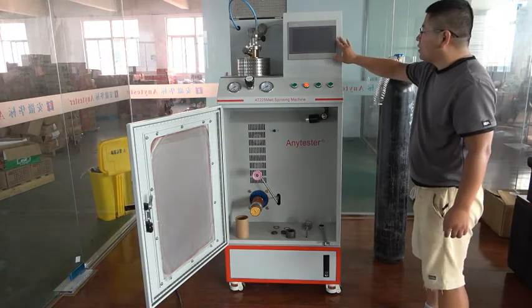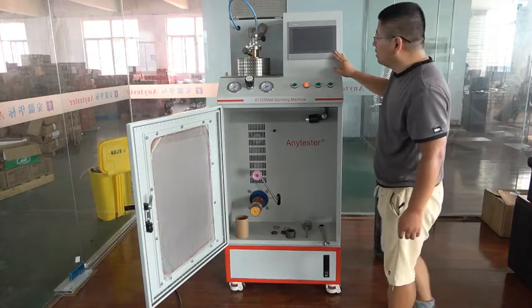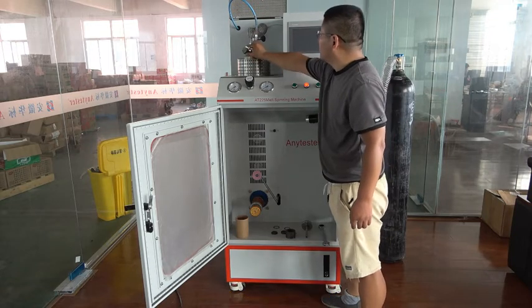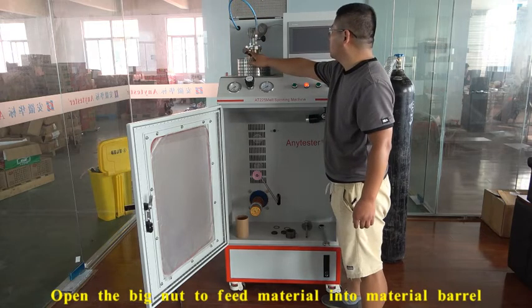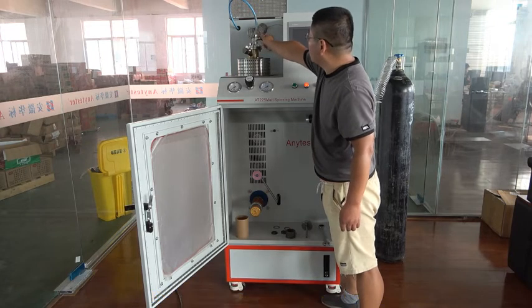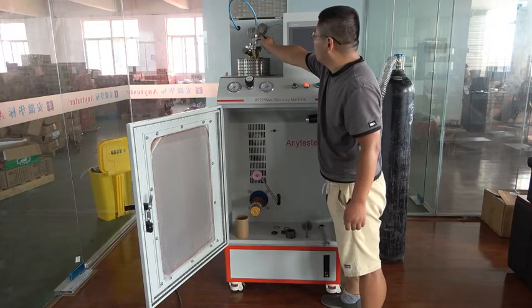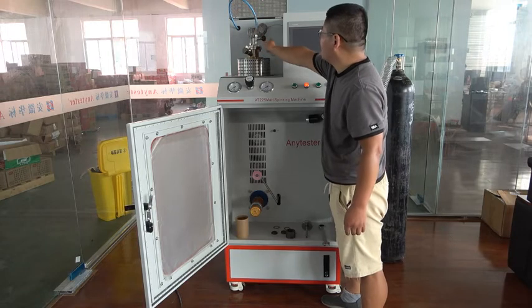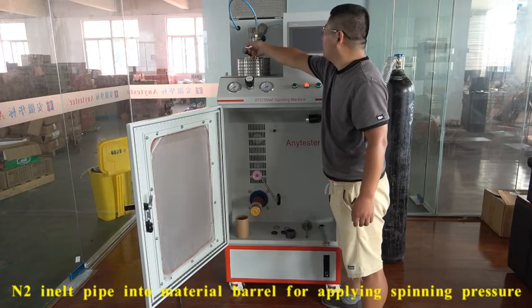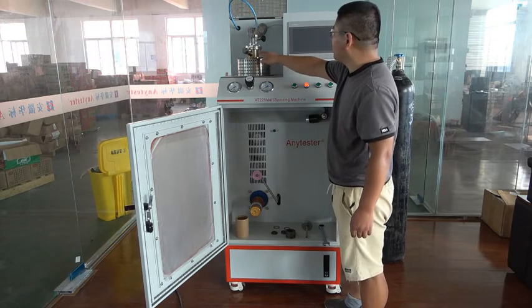This touch screen is for controlling and displaying the temperature. This material barrel — this nut can be opened to fit material into the barrel. This valve is for exhaust. After spinning, open the valve to exhaust to release the pressure.